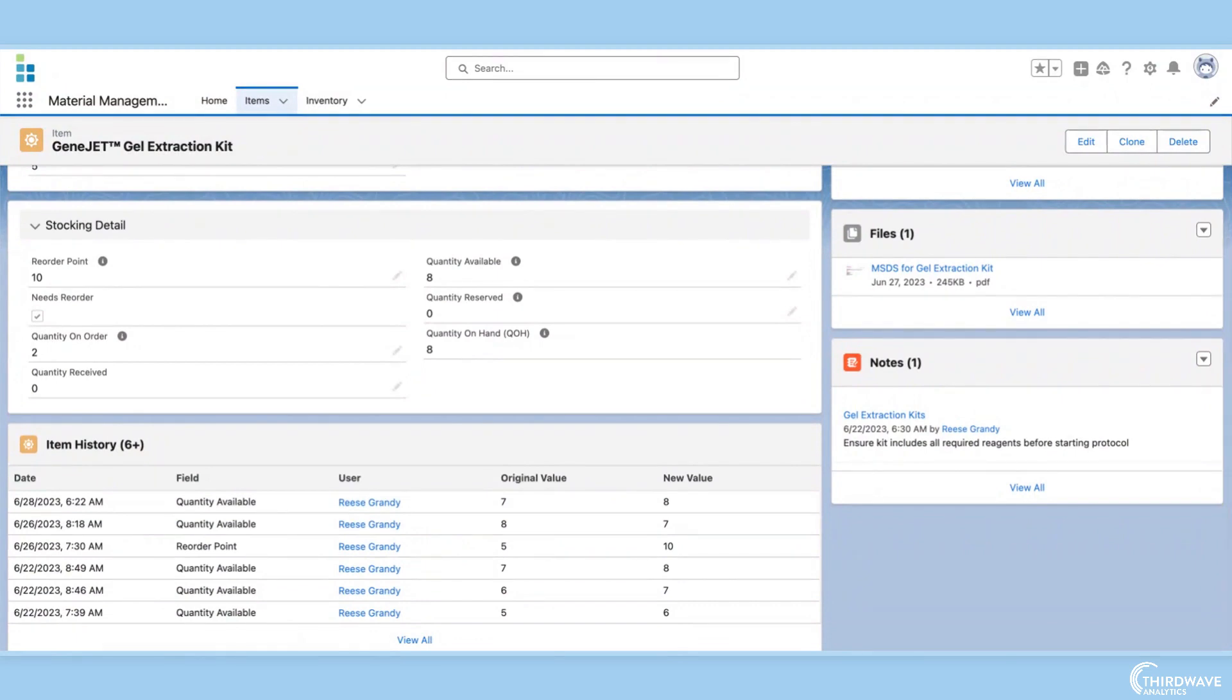The item record page will also have stocking details, which describes how much of an item is available in the lab, and will notify the lab techs and purchasing managers when inventory items need to be reordered.